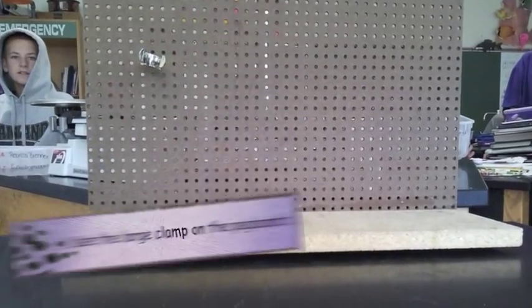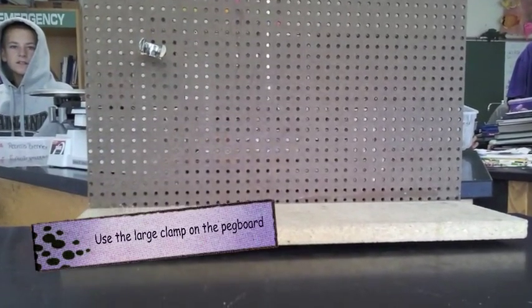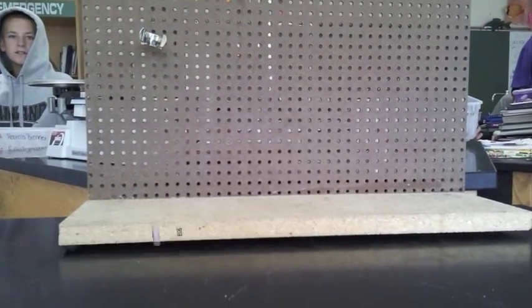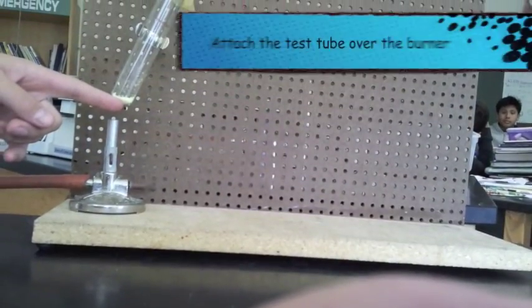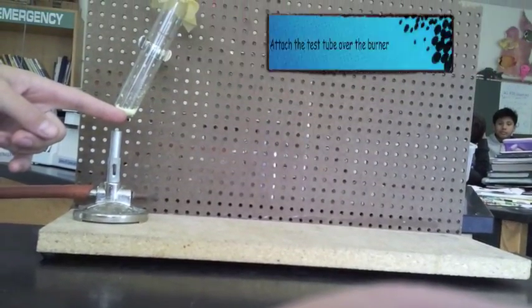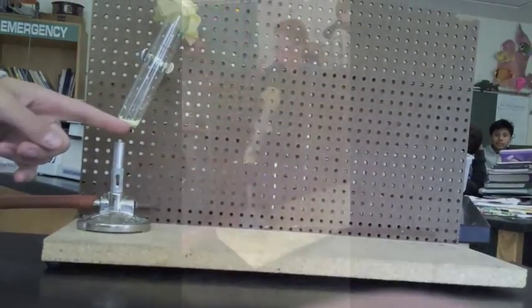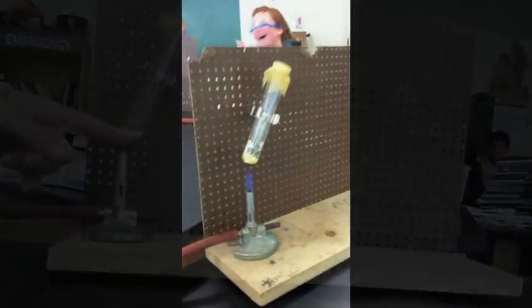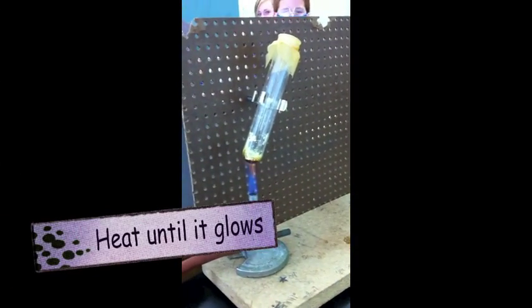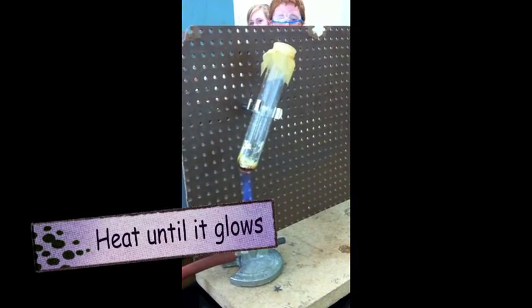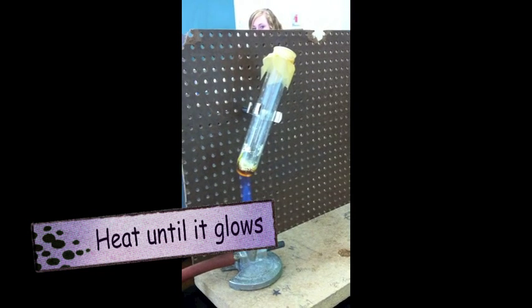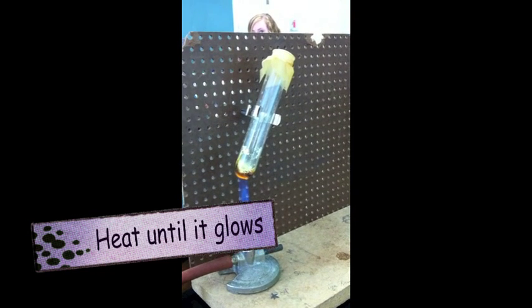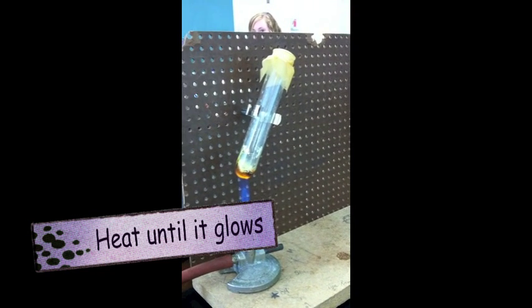We're going to set up the pegboard with a large clamp. We're going to attach the test tube to it, and we're going to begin heating it. We're going to heat it until it glows. This is the fun part here.